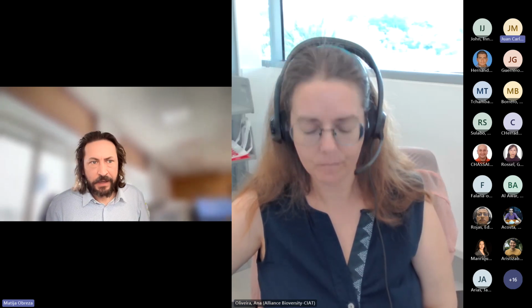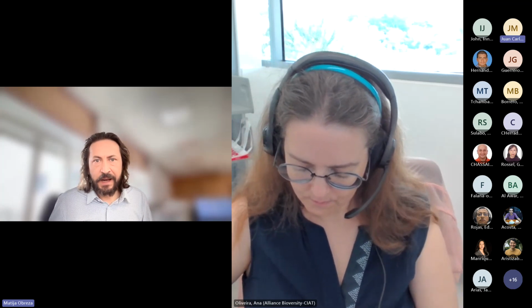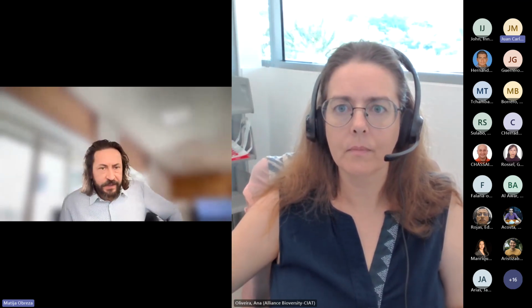I just may wrap this up. We did not go into much detail, did not want to go there, but we wanted to show some of the tools that are available and very commonly used in day-to-day things, that will allow you, not you, but more technicians, to more quickly and efficiently manage the quantities, locations, and identities of the physical samples that are in your collection. We'll leave it at this.